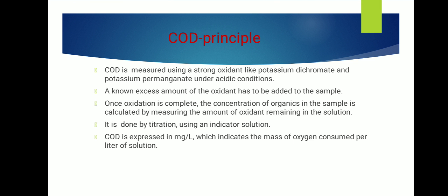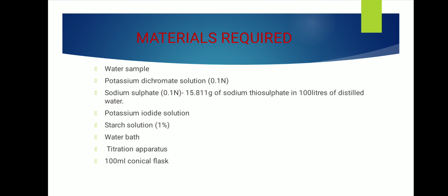COD is expressed in mg per liter, which is indicated as the mass of oxygen consumed per liter of the solution. And now let's see the materials that are required for carrying out this experiment.